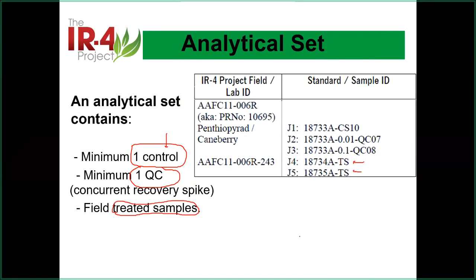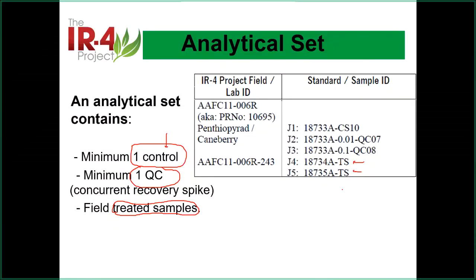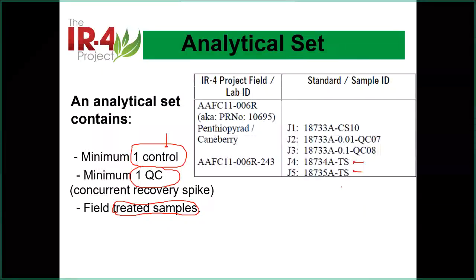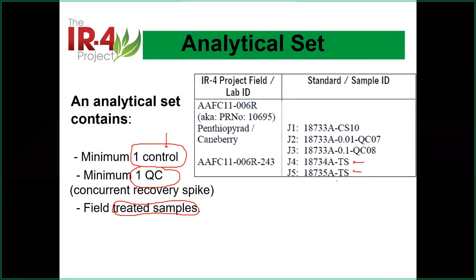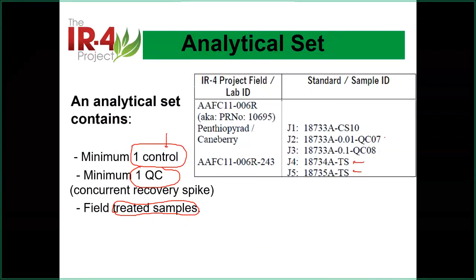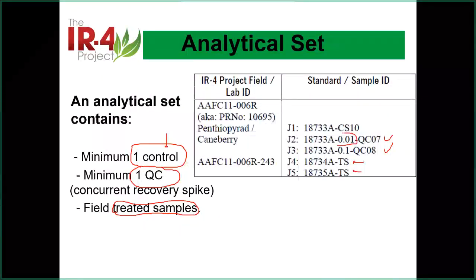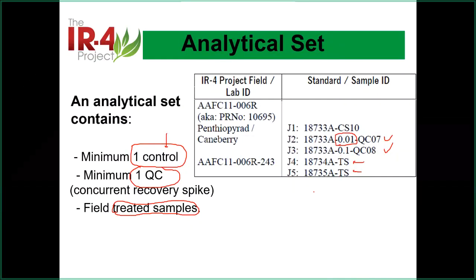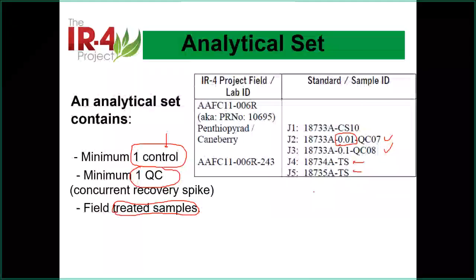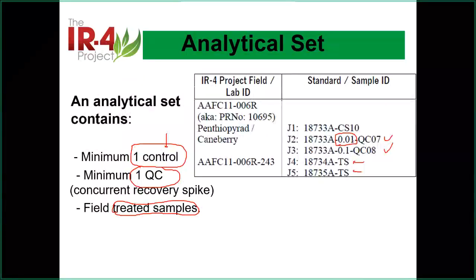Well, here's the question now. How do I know the residue? We don't know. So in this case, you have to use your scientific judgment. And here's another question now. Different requirements are here. Some places always require you to have the lowest LLMV in there. For example, I think that's the EU requirement. So when you do your analysis, it must always have the lowest spike.